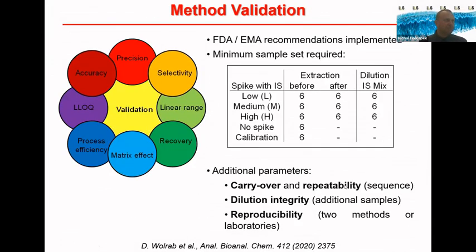Another important step, extremely time demanding and boring, is the method validation. We have implemented these recommendations from FDA and EMA and developed the protocol how to validate all new methods for the quantitation. Here, I'm not going to explain anything concerning these individual items because this was already published and because it would take more than 1 hour to explain everything.